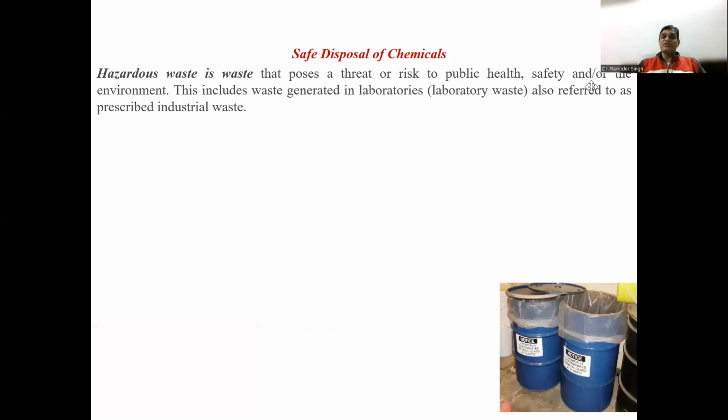Hazardous waste is waste that poses a threat or risk to public health, safety, or you can say to the environment also. This includes waste generated in the laboratory, which is also referred to as prescribed industrial waste.